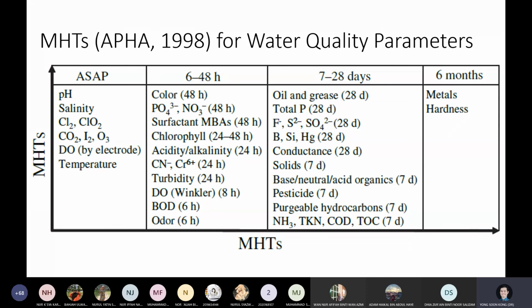From my experience, I did sampling before. The best is you analyze immediately, straight away, clean data, very predictable as expected. But after you wait for 7 days, the pH will first go different, very different, and usually it will go down, very acidic. If it goes very acidic, that means bacteria is there. These are the things that you need to consider.